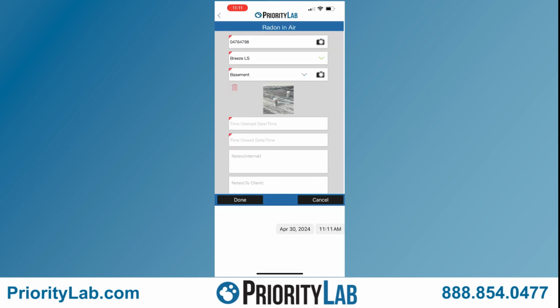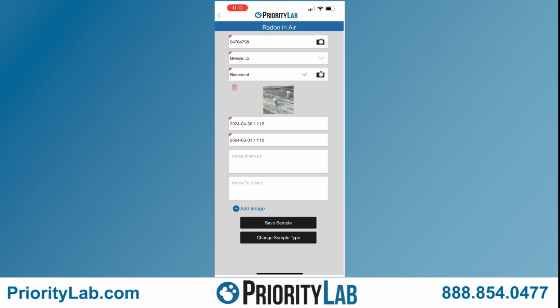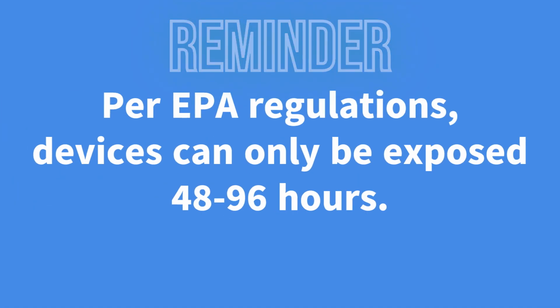Next, we will fill out the time open and time closed fields. Simply click the function that will automatically populate the current date and time. If you need to adjust these, simply click the function and scroll. Follow the same steps for the closed date and time. As a reminder, you can only have these devices exposed for a minimum of 48 hours and a maximum of 96 hours per EPA regulations.